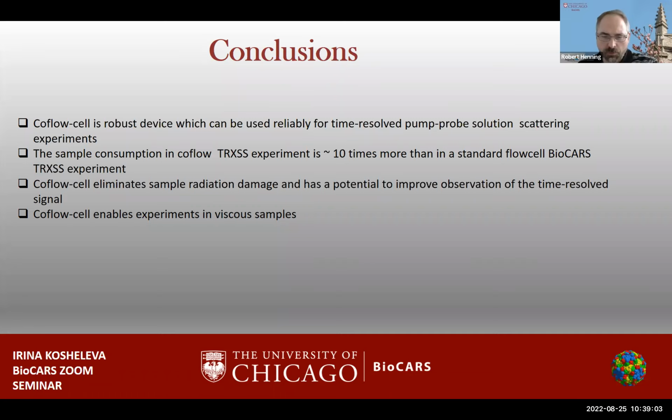Well, I guess I have a question. Was the PYP data collected in the horizontal or the vertical orientation for this? Yeah, I collected this in the vertical orientation. I think the concentration was 1.5 millimolar, probably closer to 20 milligrams per milliliter. Okay. This is much smaller than, for example, was used by Jan-san in his PYP experiments. They have to correct the data for the protein-protein interaction.